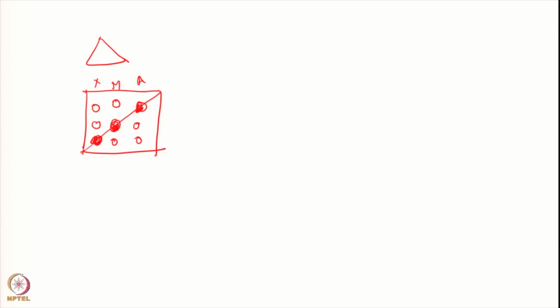Okay. So all these are cross peaks. Now, in each one of them we will have one active coupling and one passive coupling.